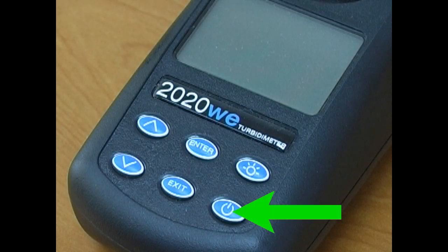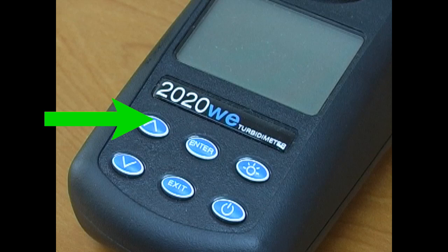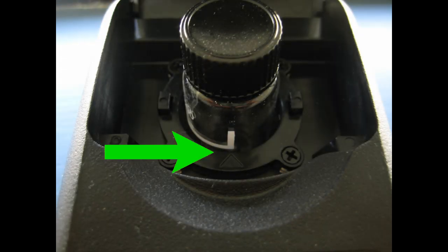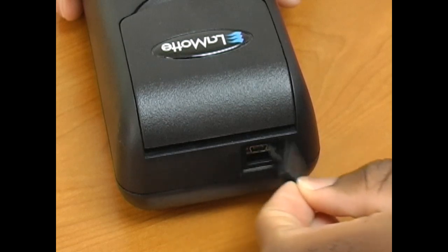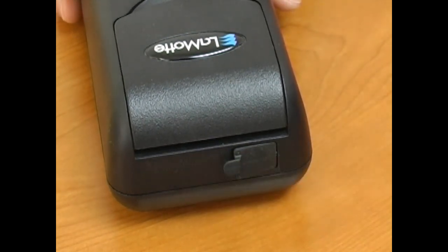On the meter you will find the power button, the backlight display on and off button, the up and down scroll buttons, the action enter button, the action exit button, the sample cell holder with indicator arrow for sample cell alignment, and the USB port located behind the replacement watertight plug.